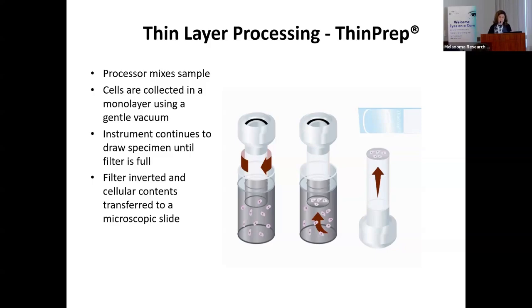And then we take this filter prep, and we place it on a glass slide. And again, using a vacuum, the cells are transferred from the filter to the glass.